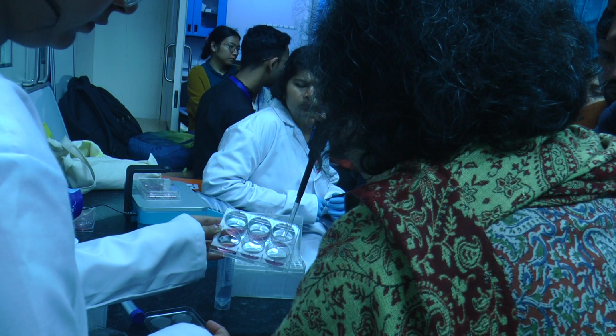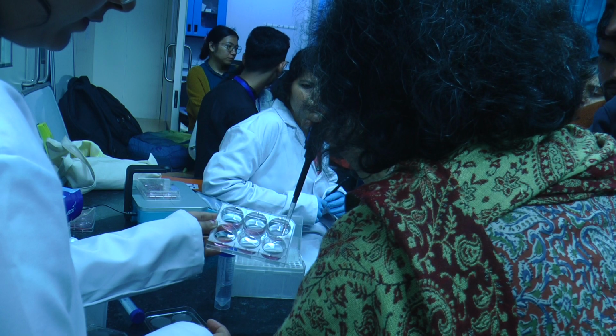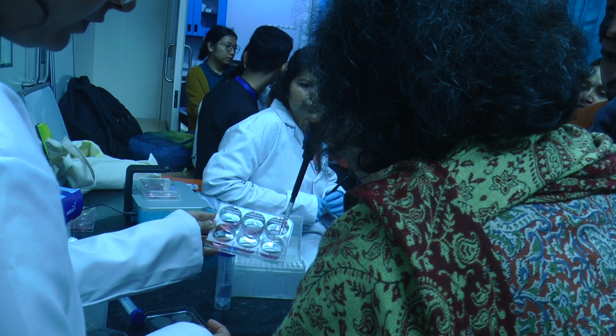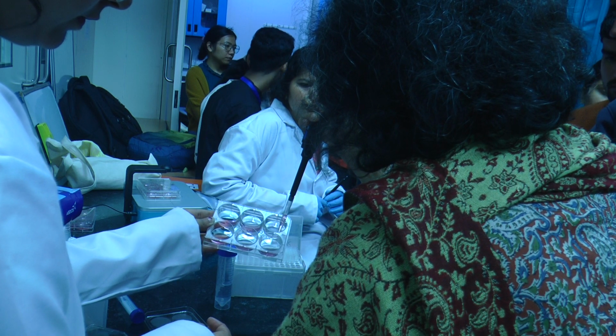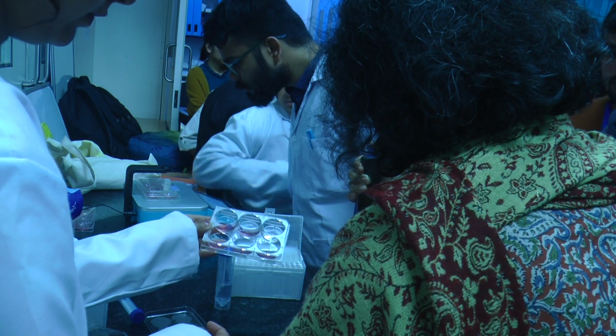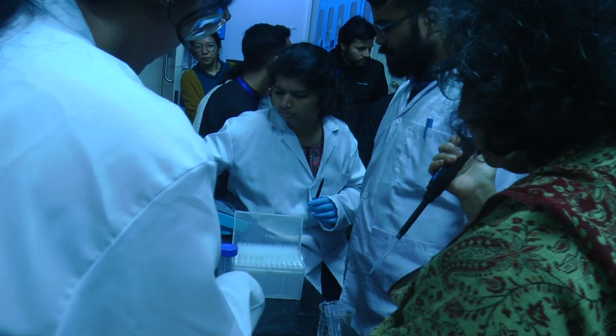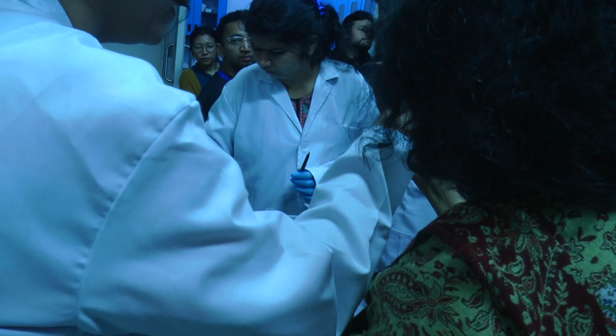As much as I can remove, right? It's enough. Now you can discard this tip from here.